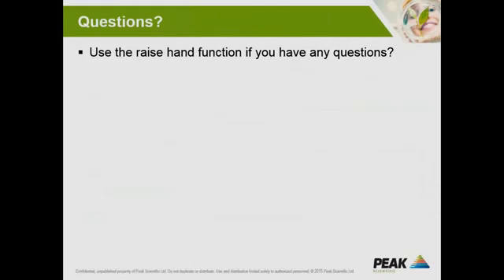Okay, his reply says his GCs are from Agilent and from Perkin-Elmer. Yeah. So I have a guide that I would be able to provide on the trap recommendations from Agilent. I would imagine that Perkin-Elmer and Shimadzu and other manufacturers follow pretty much the same recommendations anyway. So if the gentleman would like to send an email, I'd be happy to provide that information. Sure.